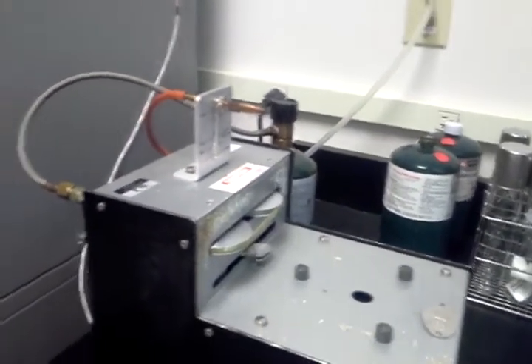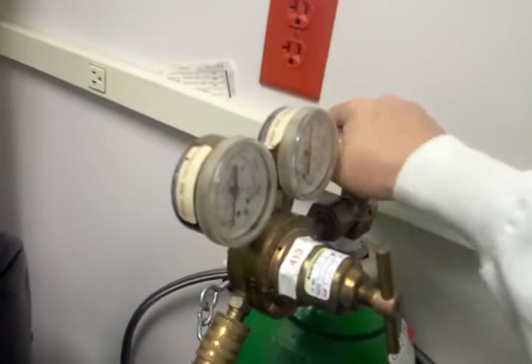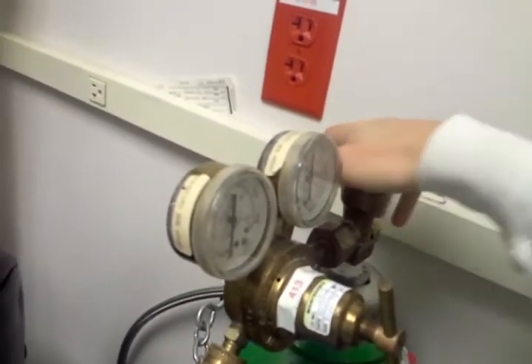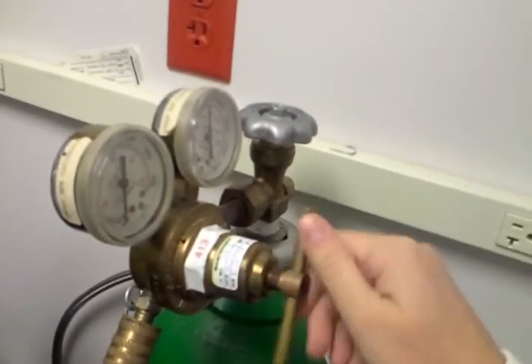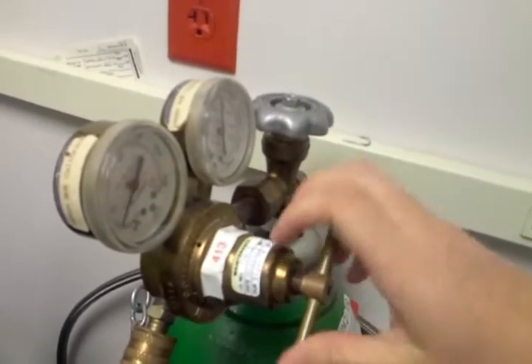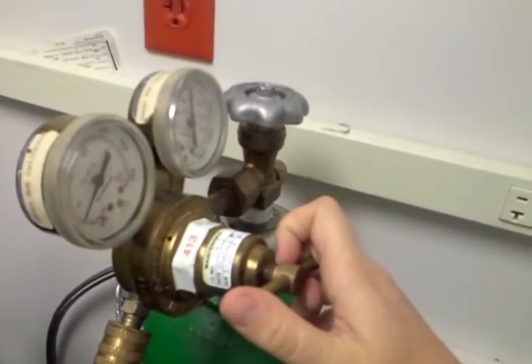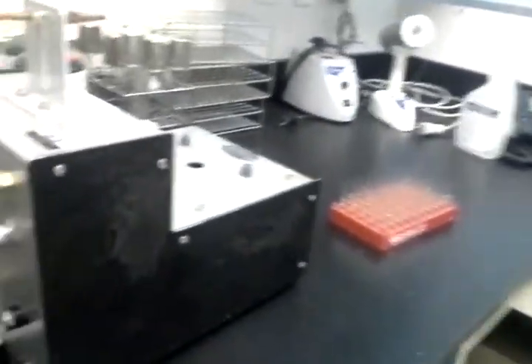But first, I have to turn on my oxygen. This oxygen tank leads to that device over there. So I'm going to turn the oxygen on and set the pressure to about 100.